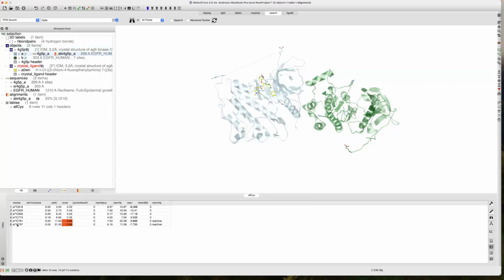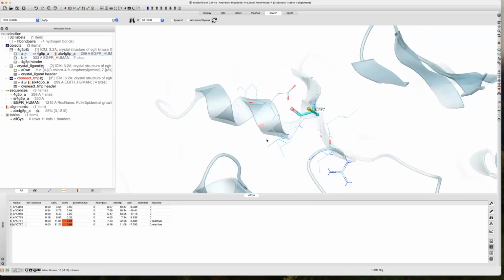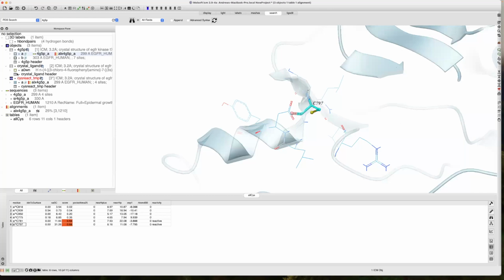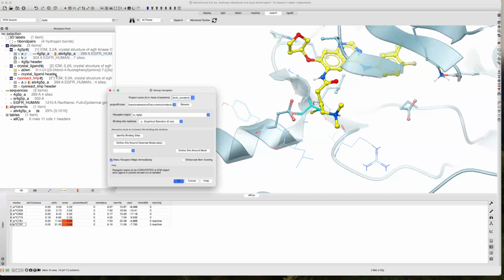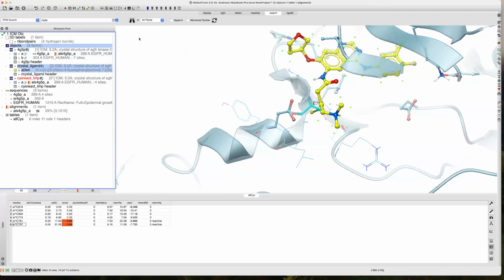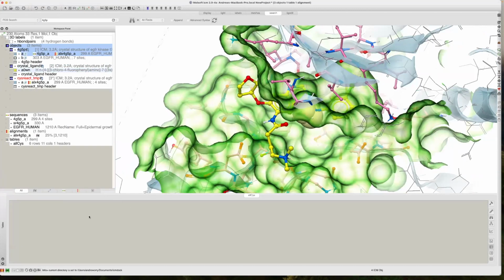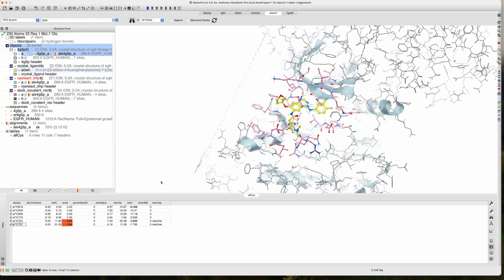So there are two reactive cysteines. One of them is the one we're going to target, cysteine 797. So we need to set up the docking. We go to the docking menu, new project. We're going to call it dock covalent. I'm going to use the ligand to define the pocket. So I select the ligand here, go docking, new project, find site around ligand. So we have the green crosses around the pocket we're going to dock to. And we're not going to make maps immediately because we're going to remake them in a minute when we define the covalent site. This is the probe. We just go OK. Go. The purple box is good. So we go. And it's making a map.